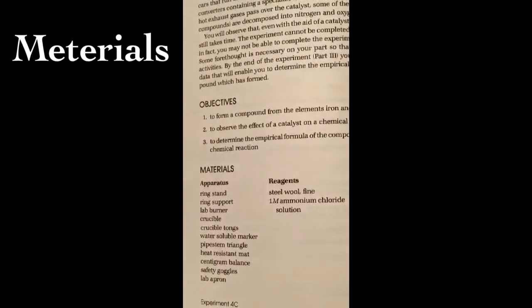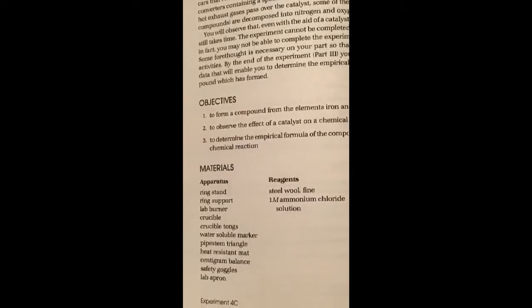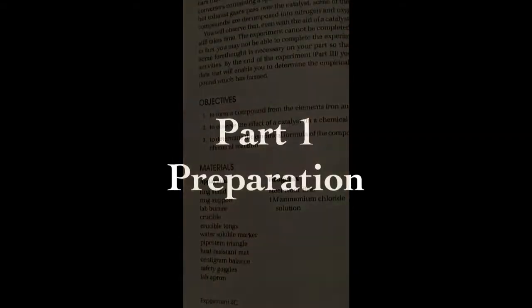The materials needed for this lab in the apparatus section are a ring stand, a ring support, a lab burner, a crucible, some crucible tongs, a water-soluble marker, a pipe stem triangle, a heat-resistant mat, a centigram balance, safety goggles, and a lab apron. In the reagent section, you will need steel wool and ammonium chloride solution.